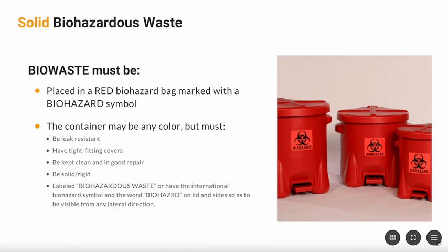The container must be solid/rigid and able to maintain its shape and integrity. The container must be labeled with biohazardous waste or have the International Biohazard symbol and the word biohazard on the lid and sides so as to be visible from any lateral direction.